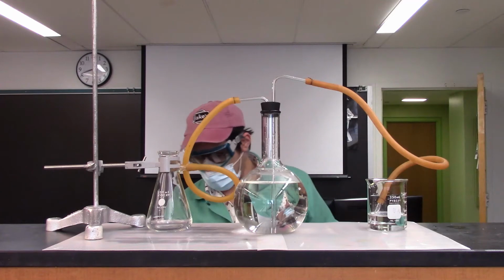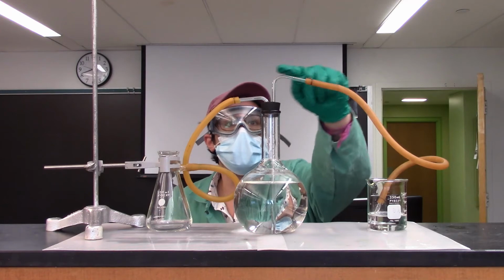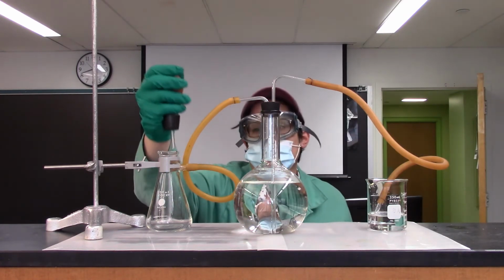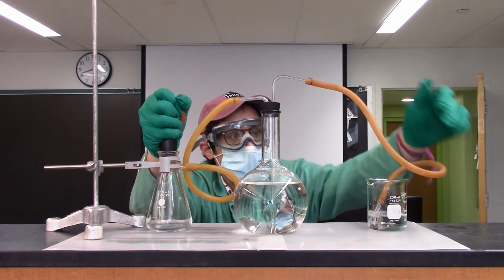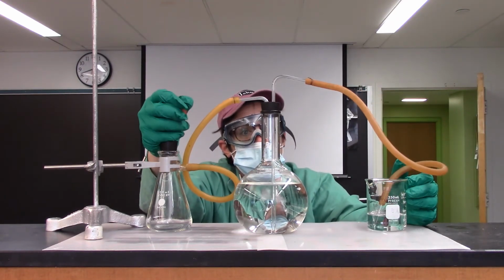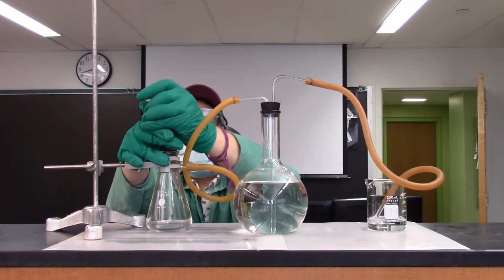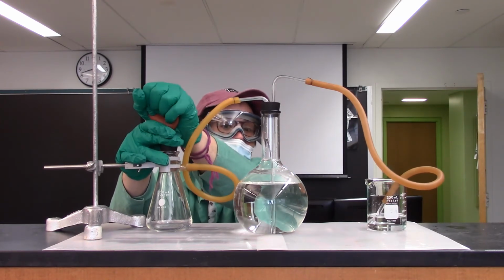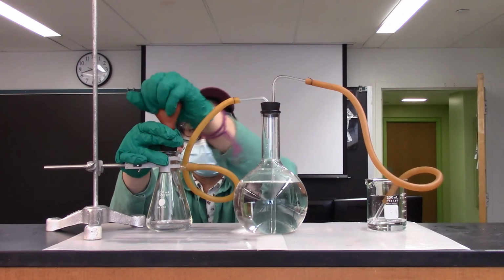But what I want to do now is purge my system so that there are no air bubbles in this line here. And why is that important? It's important because if I have air throughout this line anywhere, it's going to be quite problematic, because then we won't have an accurate reading of the gas that would be displaced.